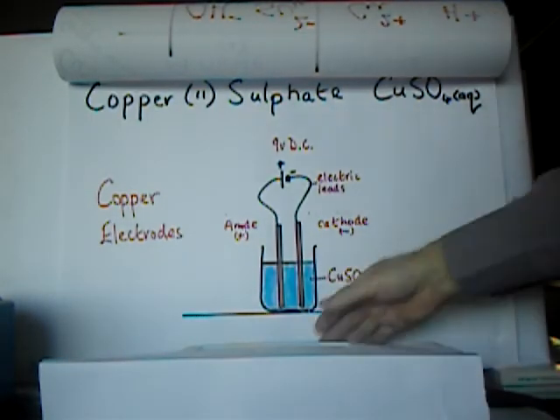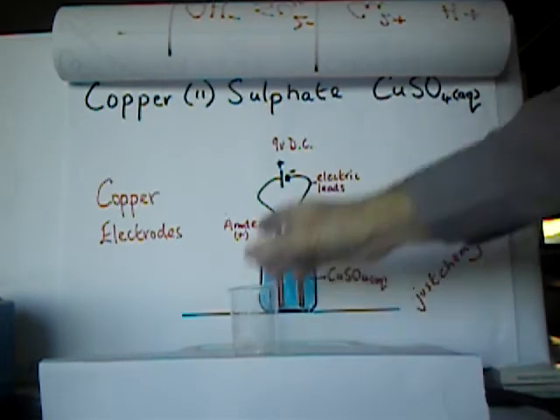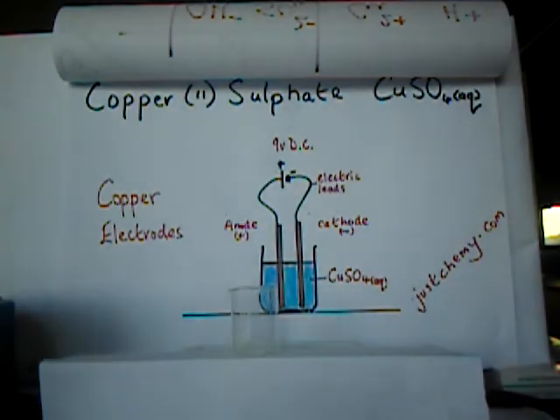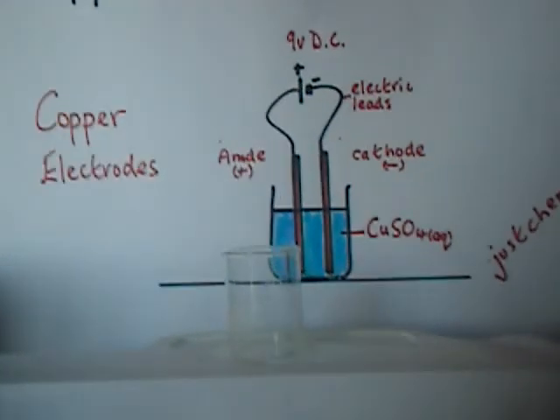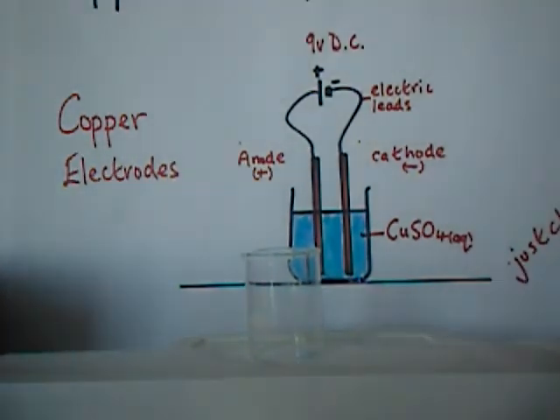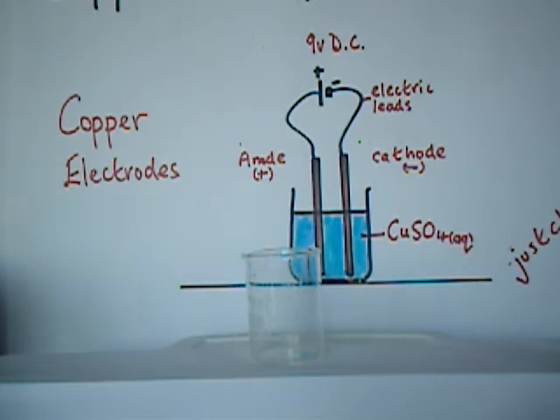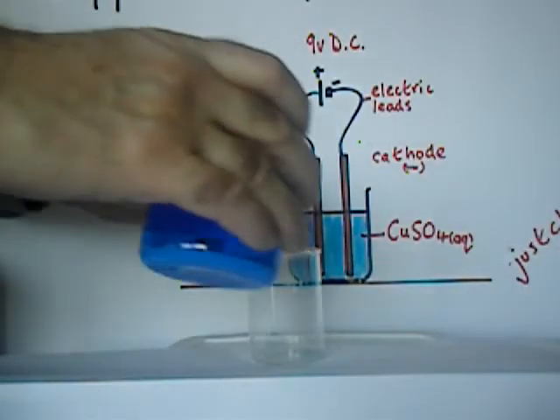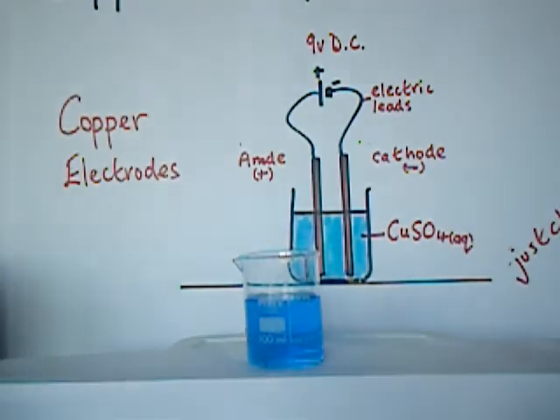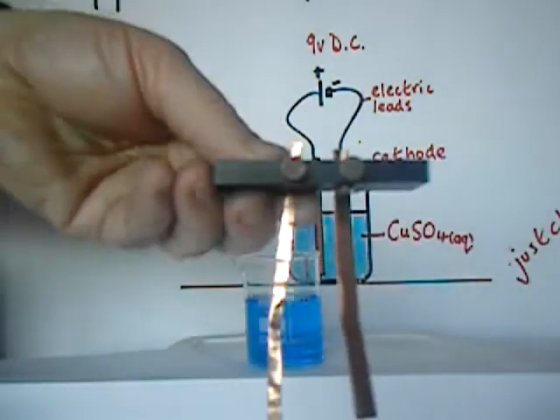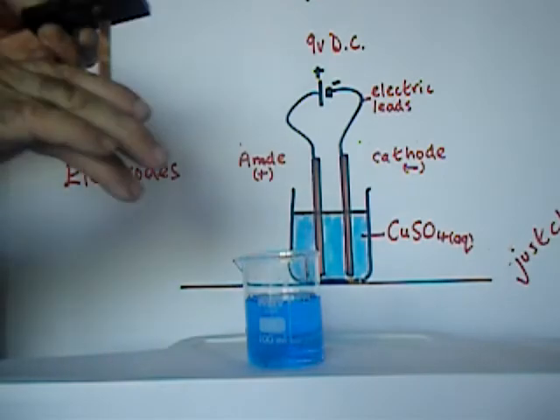So if I take a small beaker here, I'm going to pour some solution onto this. Maybe bring this in a little bit closer. Now, I'll pour some copper sulfate solution into that beaker. Now I have my electrodes here, as you see. I'm going to immerse those into the electrolyte.